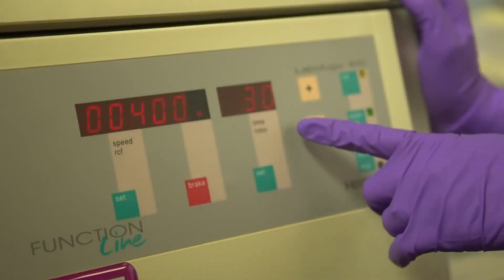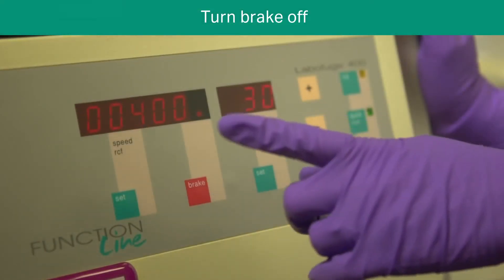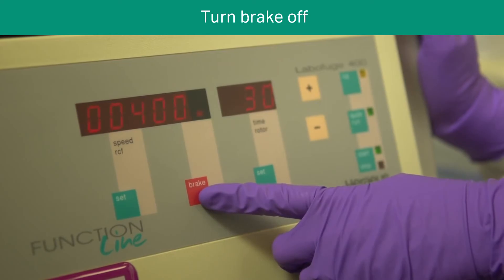Set the centrifuge to 400 g for 30 minutes at room temperature, remembering to turn the brake off.